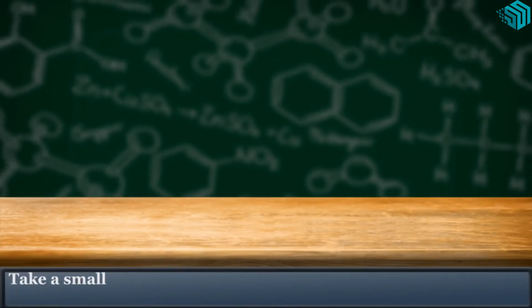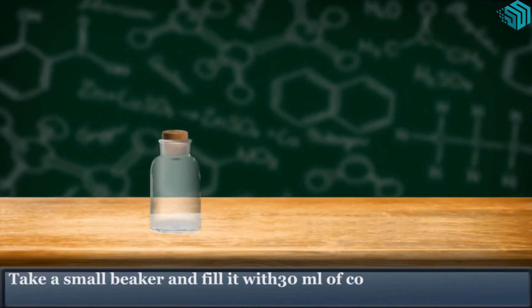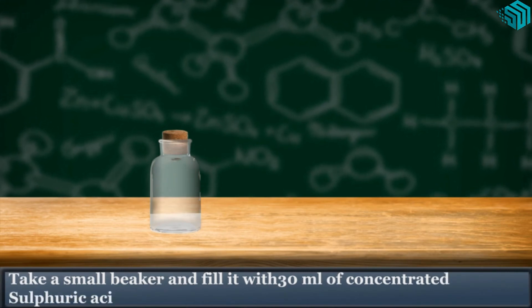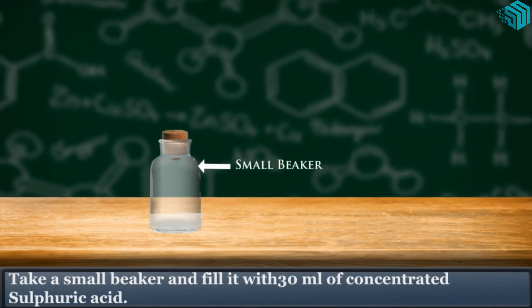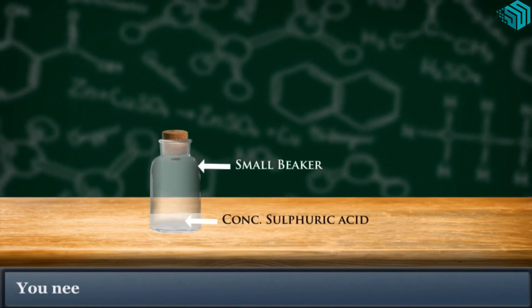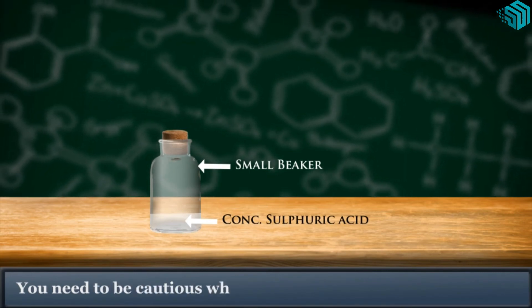Take a small beaker and fill it with 30 milliliters of concentrated sulfuric acid. You need to be cautious while handling acids.